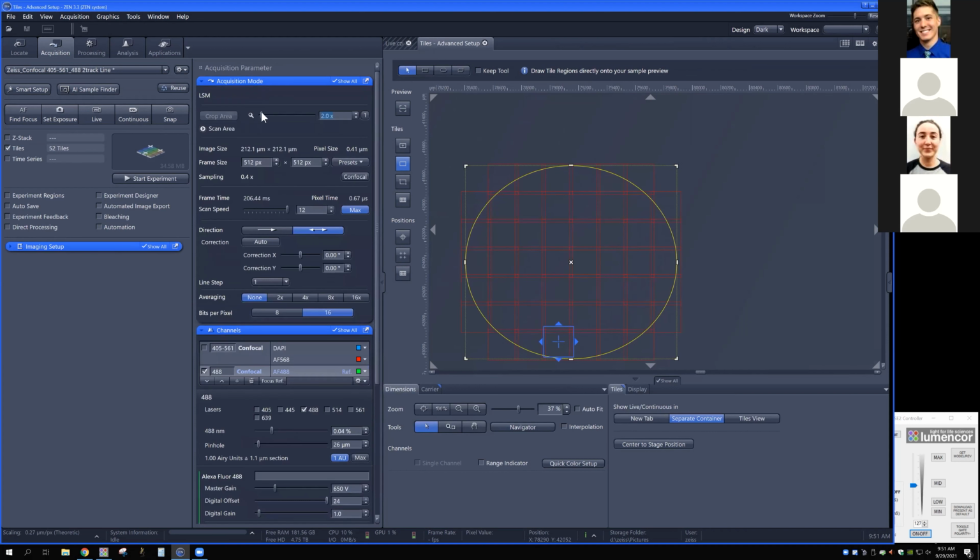We're going to zoom out as low as we can go. We can just do this with the 20x, I suppose. Let us get that back. Well, actually, you know what? Let's do it with the tool that I'm talking about.